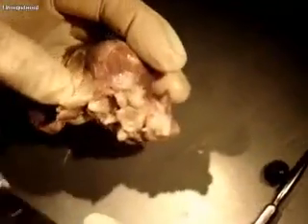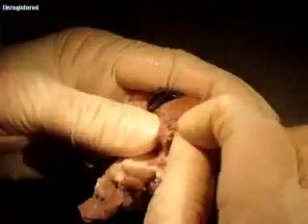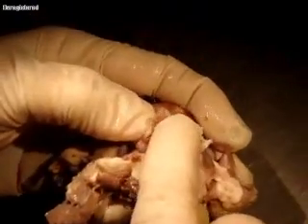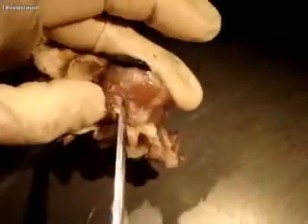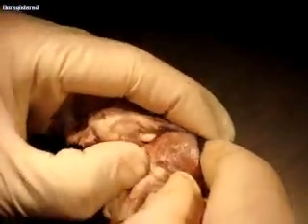Here it is. So see what I've got, this little hard thing I was trying to find? I found it. Right here, that's your optic nerve. See it right there? That's the optic nerve. It's very, very hard, coming out of the back. And if you were to continue to pick at it back here, you would see that that's going to go in at the point of the eye called the blind spot.